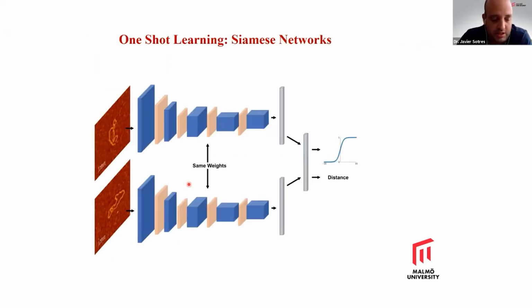So we also wanted to differentiate between different molecules. Okay, so this YOLO v3 will locate the different molecules, but then we don't want to focus all the time on the same molecule once we zoom out. So what we did is, after locating the molecules with YOLO v3, we use another type of neural networks called Siamese networks, that are pretty good for this purpose.